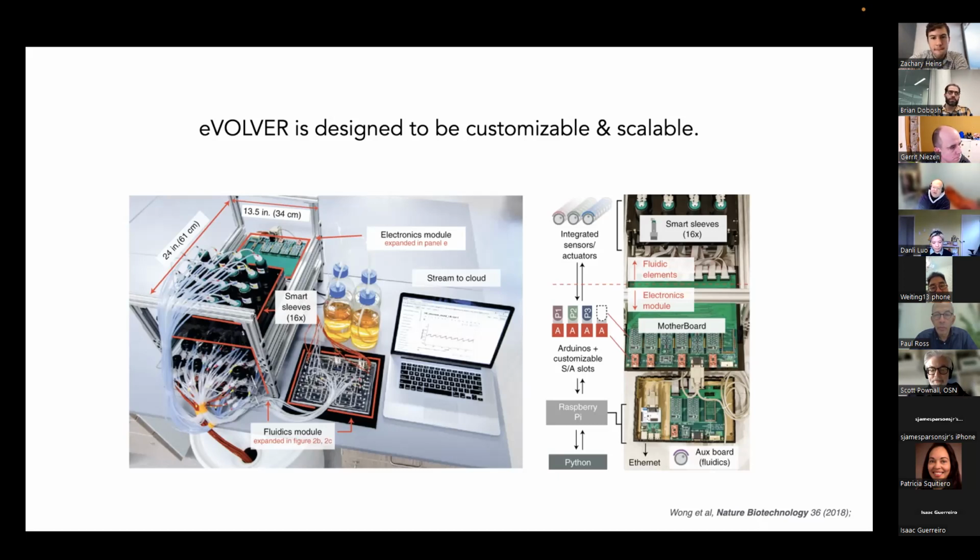The two things that I really depend on for doing that are dissolved oxygen and glucose measurement, both of which are a little bit harder to do in this kind of shrunk environment than things you can access optically. Do you have any thoughts on how the micro-eVOLVER system, which is what I'm most excited about from your talk, might get shrunk down into something we can either run on platform on the OT2 or next to it, in a way that would work in coordination with that?